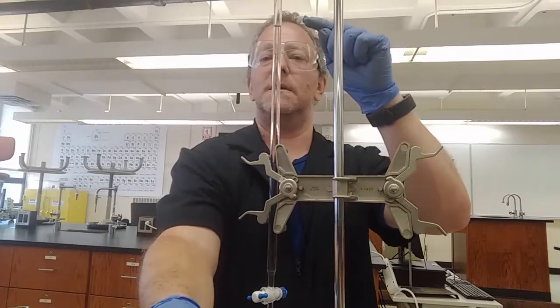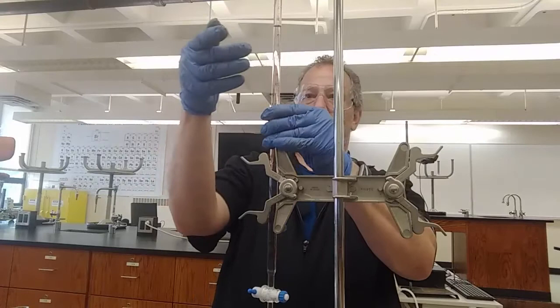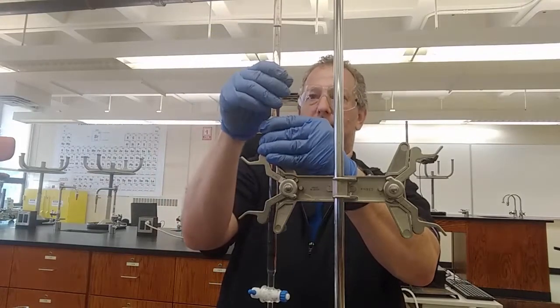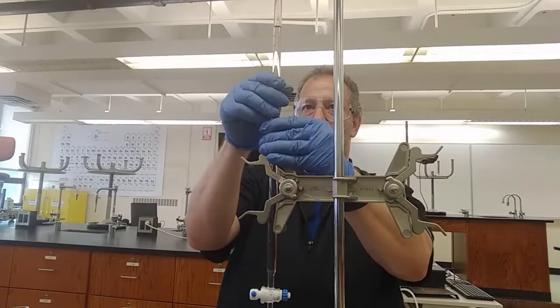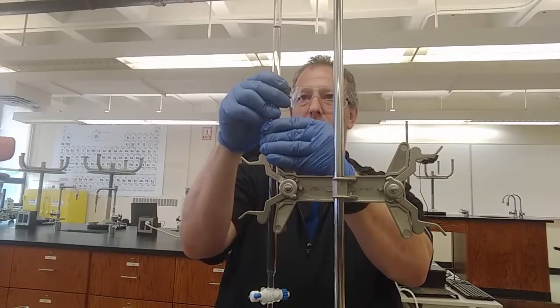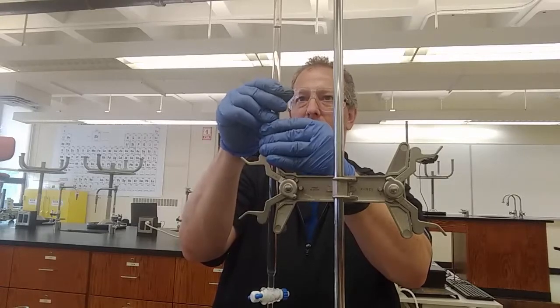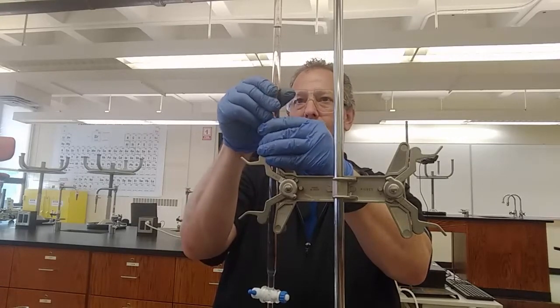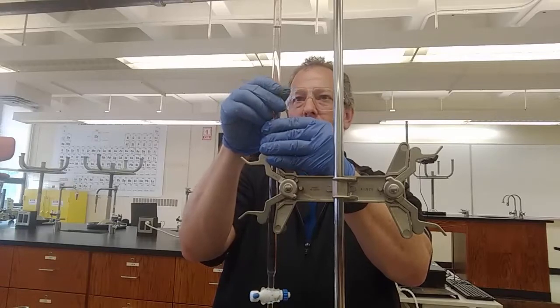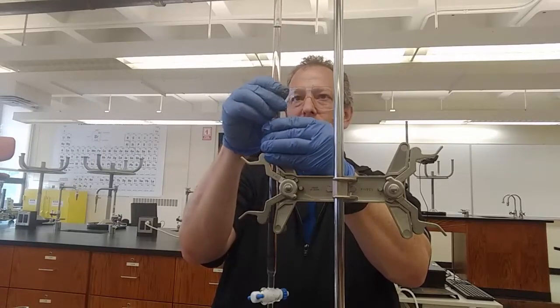You can even see it on the camera. And this is somewhere between 3 and 4 milliliters. And actually, it's between 3.0 and 3.1. You know what? Actually, I think it's exactly on the 3.0 line. Yeah. It's not between 3.0 and 3.1. It's exactly on the 3.0 line.